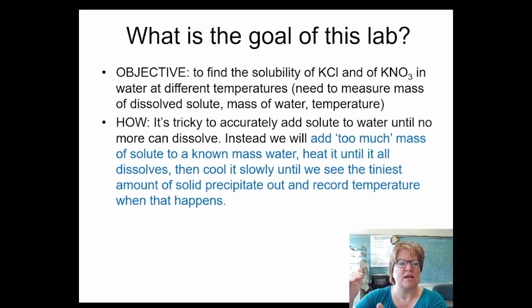And then we're going to change the temperature until it is saturated. And then we have our point. So we're going to be changing the temperature as opposed to changing the solubility. And it's a little bit of a different kind of task. But we end up getting the information the same in a way that's experimentally much easier to do.